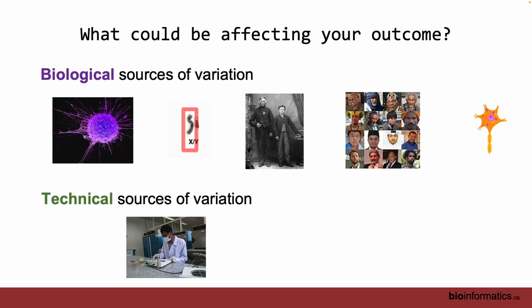So here's what you need to do. You need to find out the workflow. You need to find a review article that talks about the state of the art workflow for the assay of interest. And usually, there'll be some leaders in the field who keep on top of the method development, and they will say, this is the pipeline.